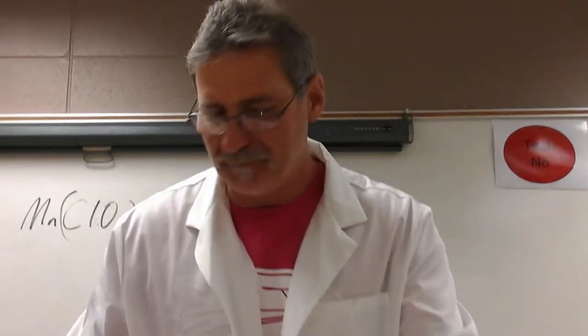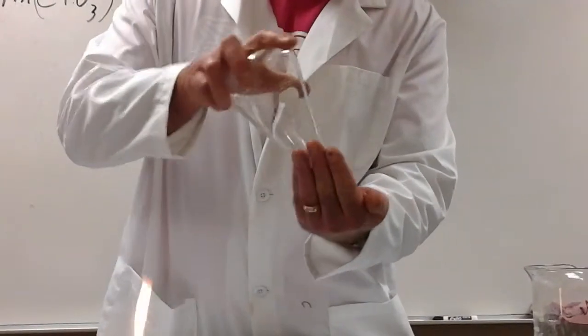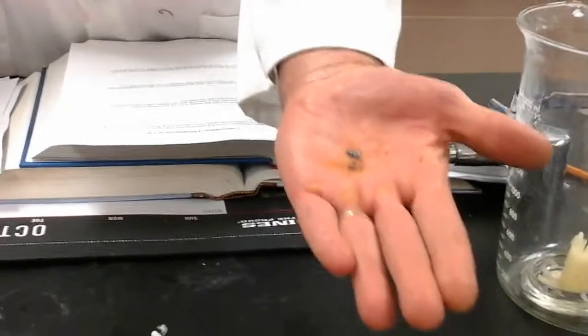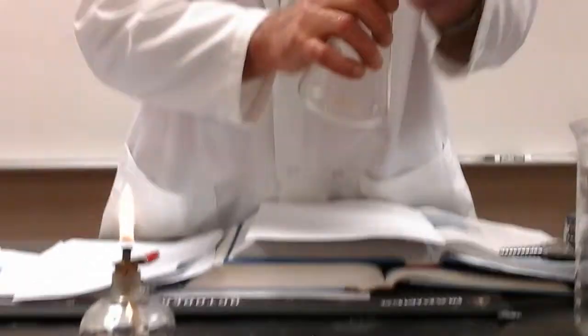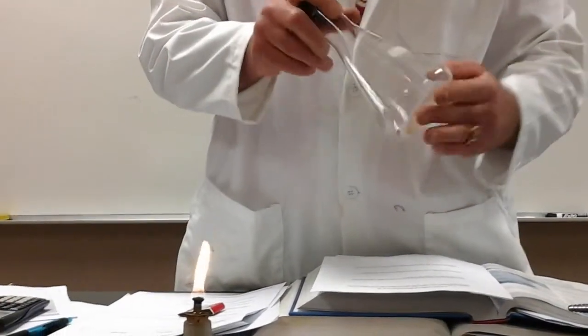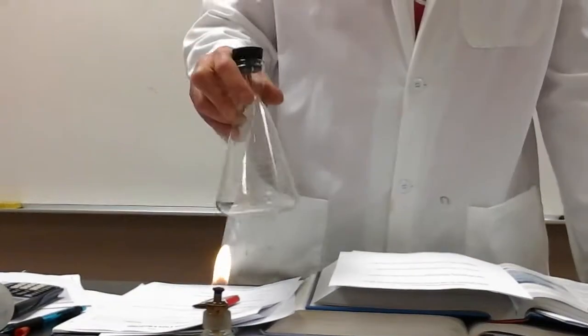What I've got here before me is some iodine crystals. Now, a lot of people naturally assume that iodine is what at room temperature, what phase? Liquid. And that's because what they're working with or putting on their wound is iodine solution, but pure iodine is actually a solid at room temperature. So that's one of its characteristic properties, chemical or physical? Physical property. It happens to exist as a solid at room temperature.